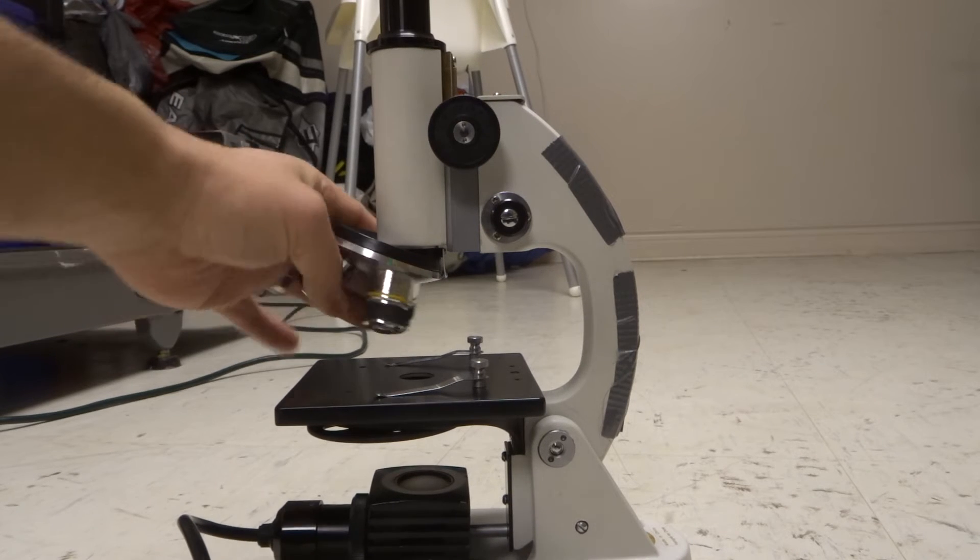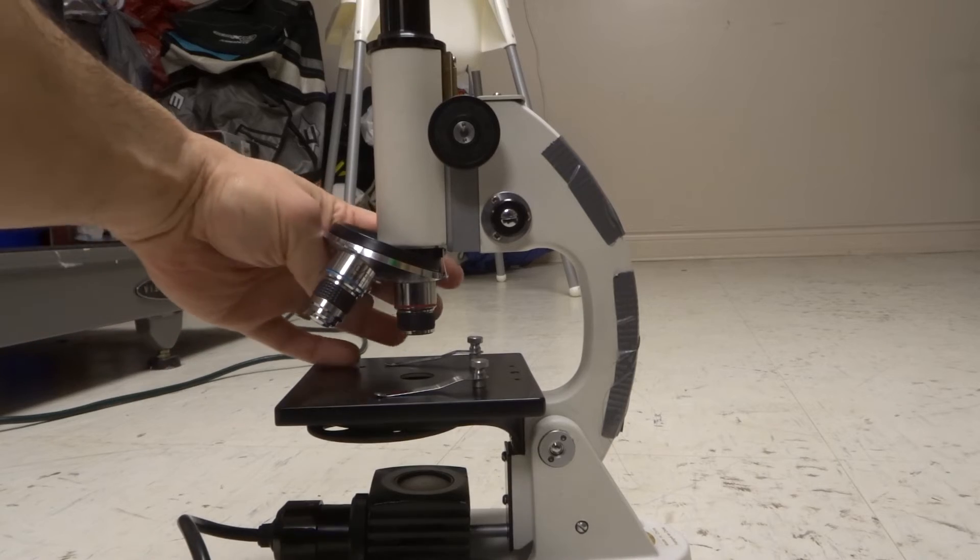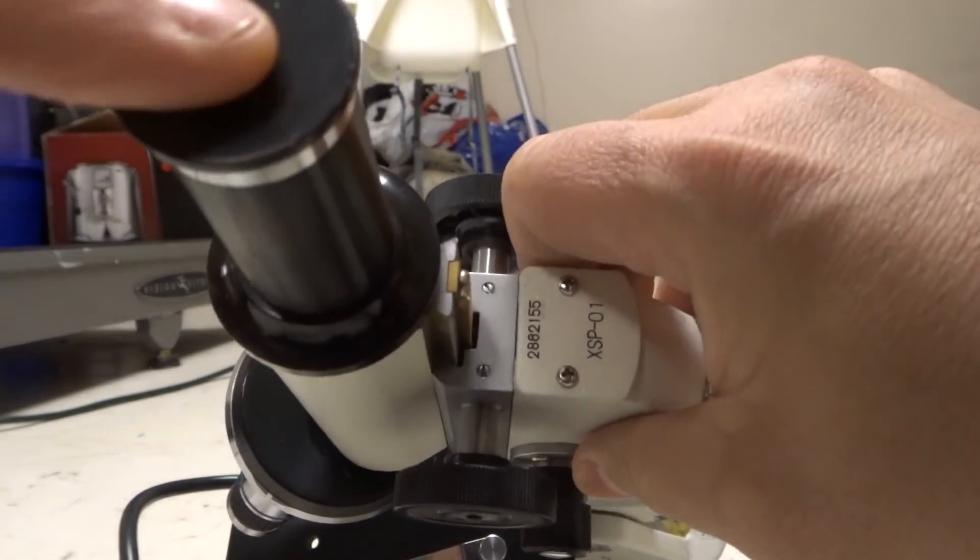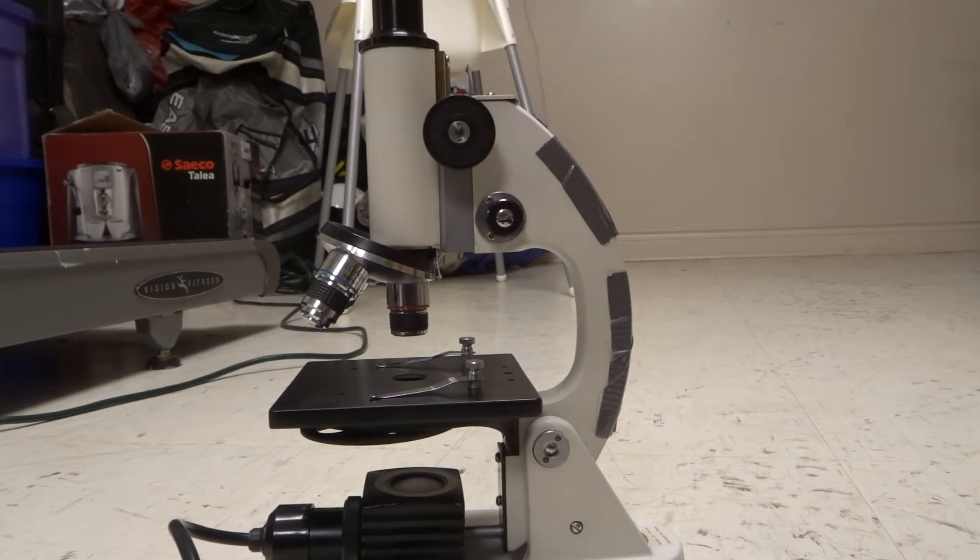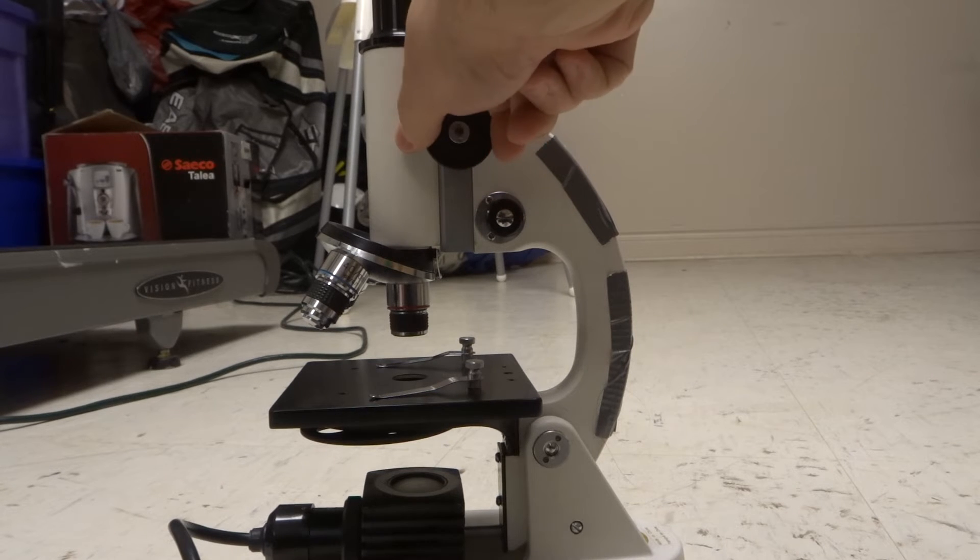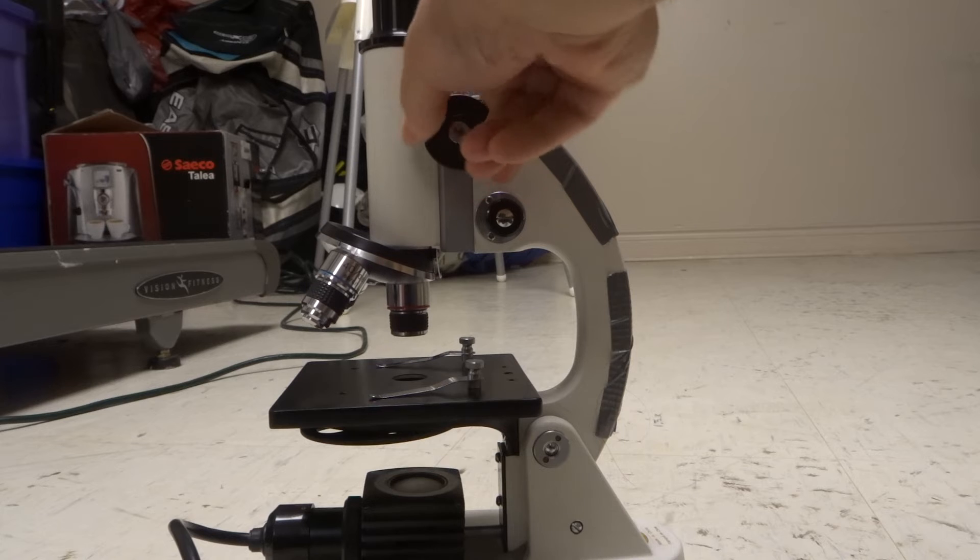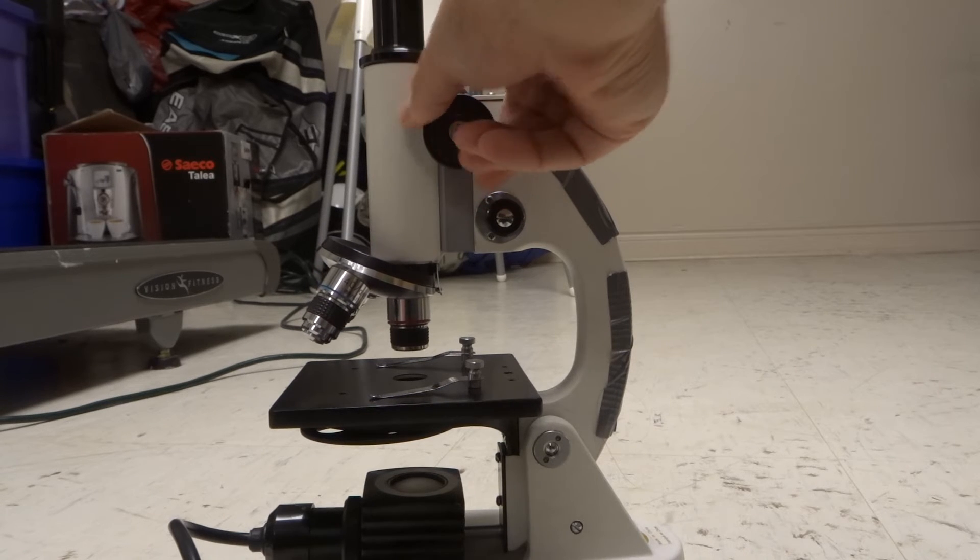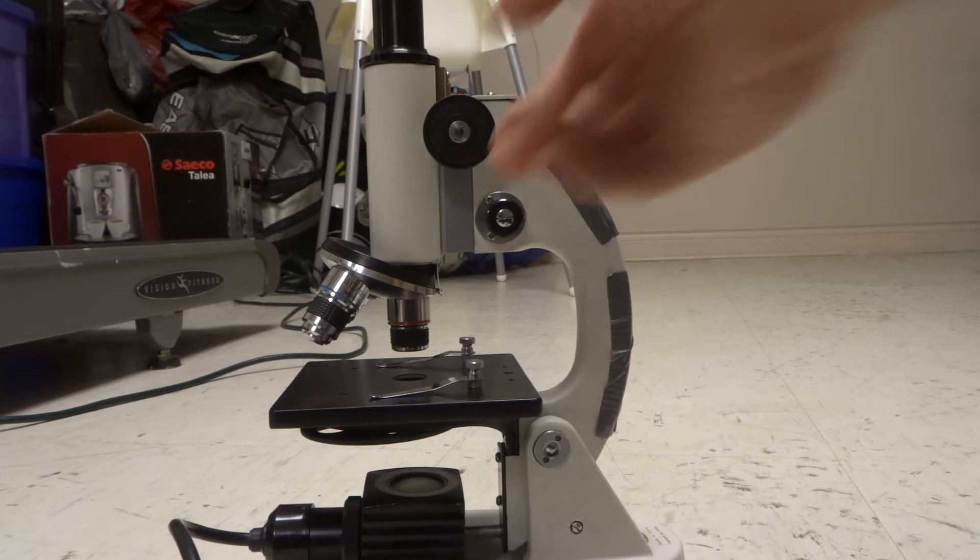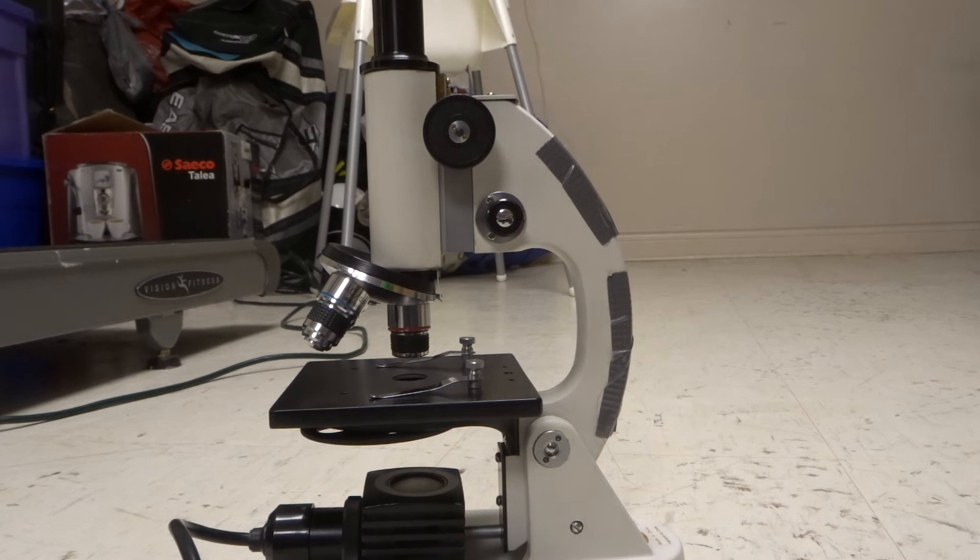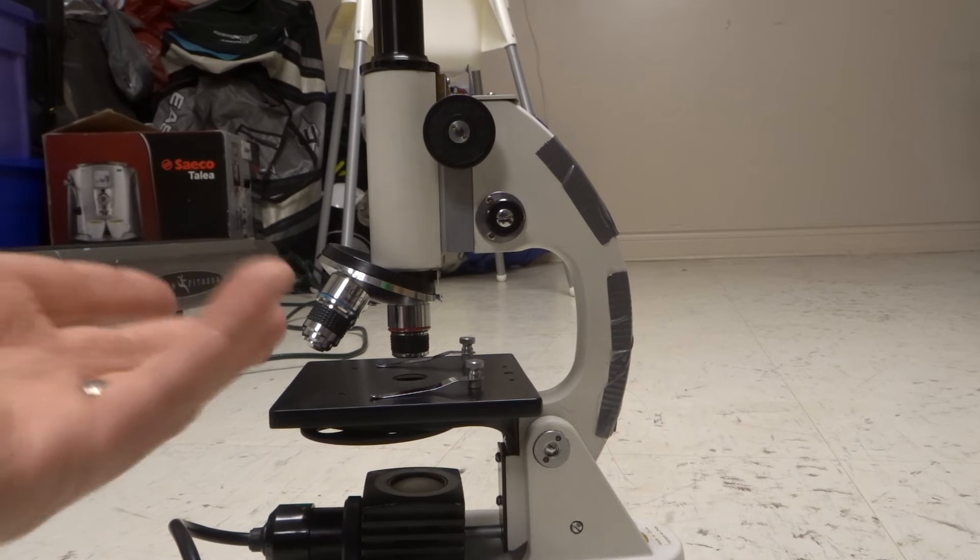So choose whichever one you want. These are called the objective lenses. You want to choose your objective lens and look through the ocular lens up over here at the top and get your eyeball nice and close to that lens. You want to get a good view inside of the eyepiece at the top there. And you want to then adjust your coarse adjustment knob. And you want to look through there and see when you can see decently clearly what you have there. So continue adjusting up and down until you get the best clarity that you can get with regards to what you see there.